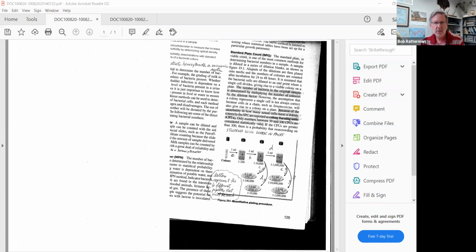The first thing that you will do is write down all of the steps, including aseptic technique, that you're going to follow in making the smear and the subsequent stain. All of the stains are going to be in those small containers, so if you forget the names, you can look at the stain names, that's no problem. But you need to write down all of the steps in numerical order, again, making sure you include aseptic technique.